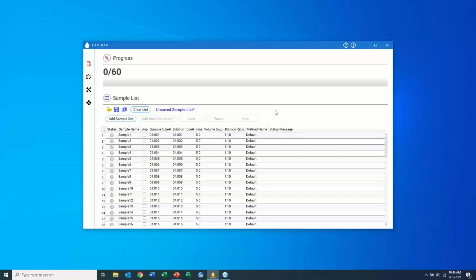So your stop is like emergency stop. You click that button, it'll stop whatever it's in the middle of, because probably we've got an overflow or something got in the way, or I forgot to remove a cap, or I didn't put the racks on yet, or whatever, these things happen. So that is stop what you're doing right now. That'll essentially stop the auto sampler, and then when you go to restart or do a next thing, it'll go into a recovery state and reprime the system.